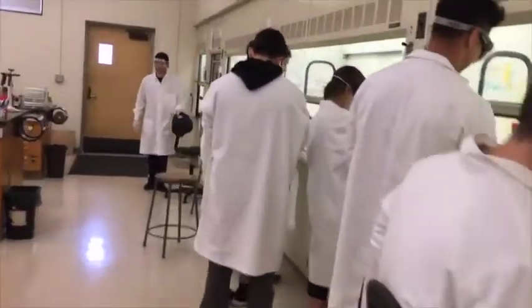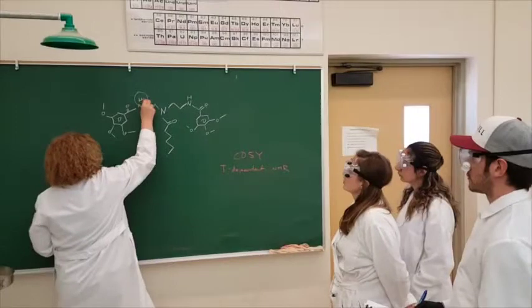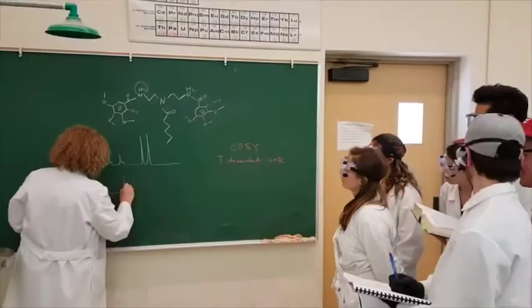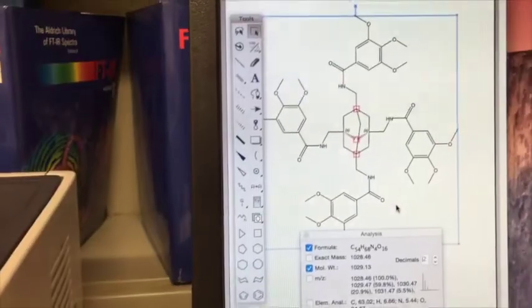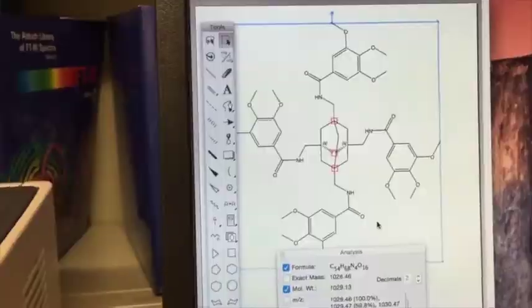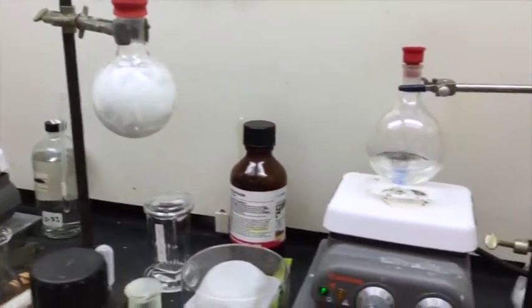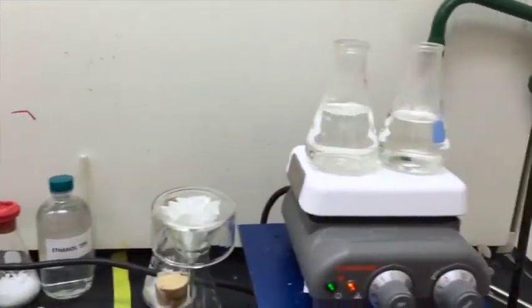Organic chemistry research is where we go to understand everything we think we know about chemistry. We take the knowledge we learned from lectures, which include predicting reaction products, designing synthetic routes, calculating the yields, and analyzing the spectroscopy data. Equally as important as theory is the understanding of various lab techniques.